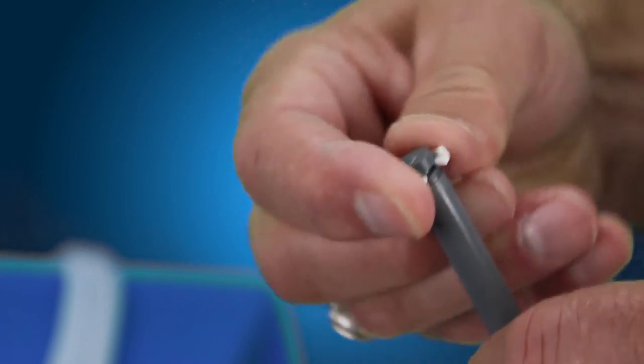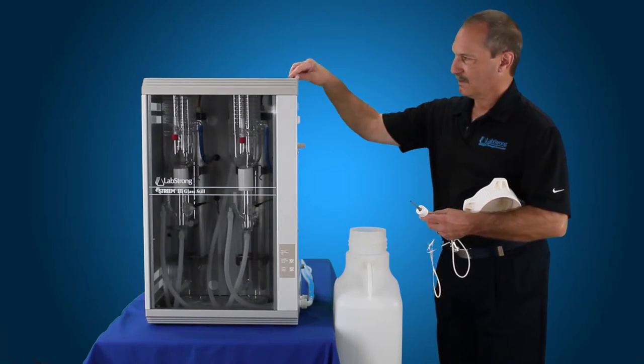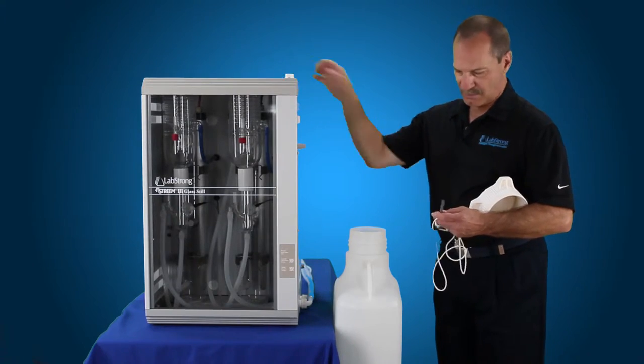There's a bottom clip that you remove. Save that because you're going to need that. Take the float off, but make sure you look at the orientation. There's lettering at the top — that has to stay at the top when you put that back on, so make sure you put that back on the right way.